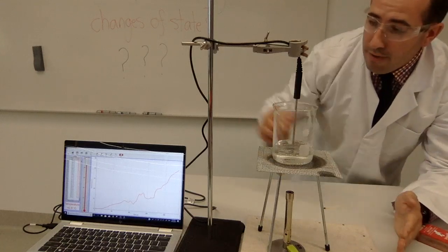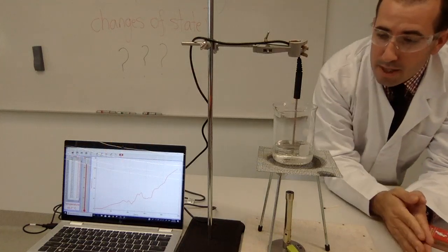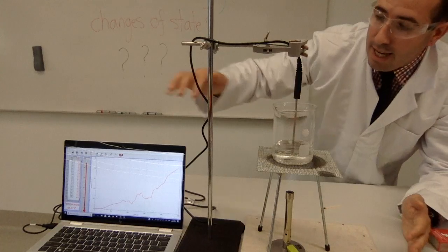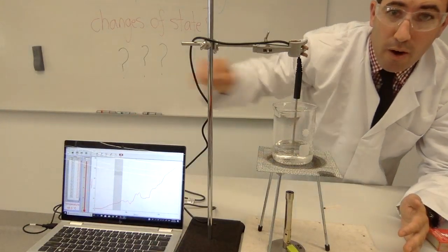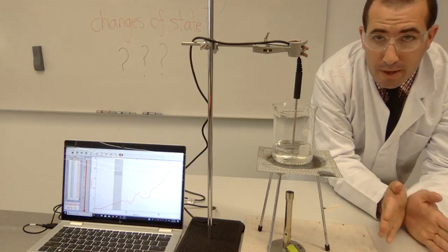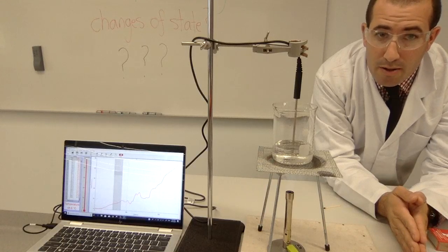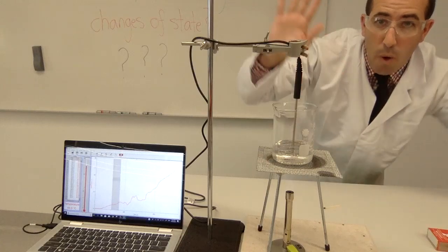Now, as you can see, the graph is going up at a relatively constant rate at the moment, which is good. So we can say that one of the errors is here, towards the start, where you had the ice interacting with the liquid. So obviously, that changes things. So soon what we're going to do is skip ahead to the finale.